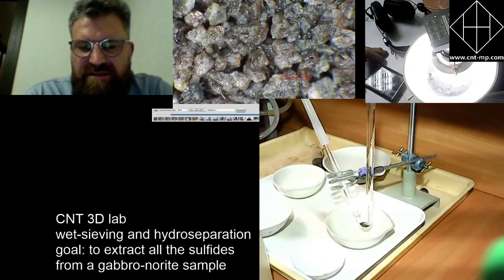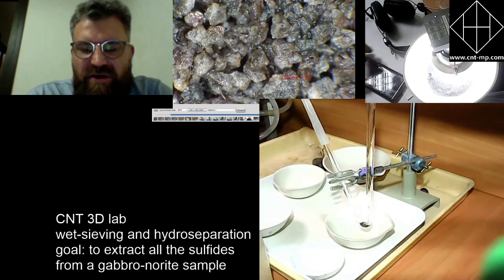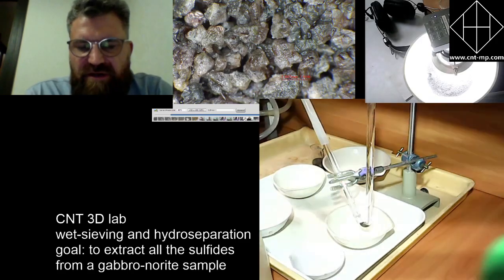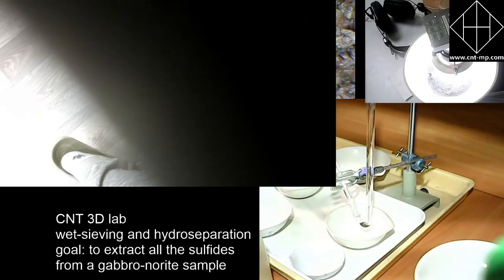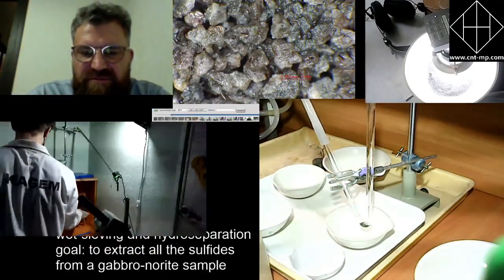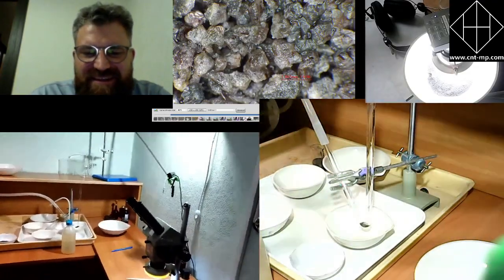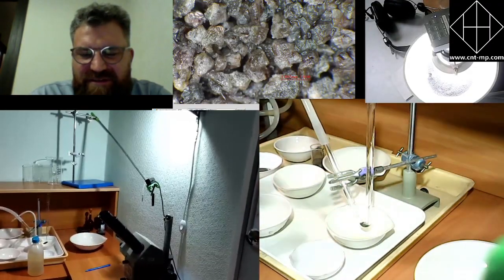So that's tailings from the same amount of fraction, you can see. And now I hope that they will reload the preliminary concentrate. Can you show the reloading process? Is it already the time to reload? Yeah, it takes a little bit of time to process some amount of material.